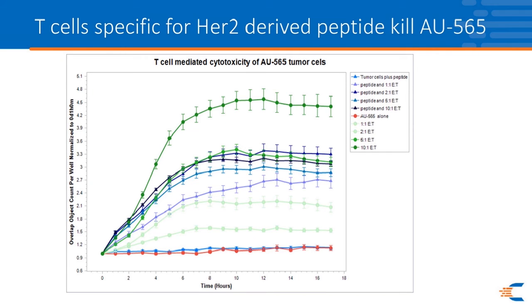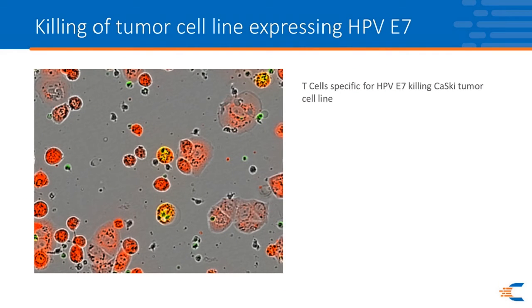So now when you put all of these images through, the nice thing is letting a computer figure out what's live and what's dead. Essentially, to go back to this picture, images from the experiment are used to set the parameters so that you're only measuring the events you want to measure. It's similar to flow cytometry in that you can adjust your parameters to look only at large cells, only at small cells, just the red, or just the green. And that is done initially. Usually, once you've worked the parameters out, you don't even need to think about them anymore, but apply that analysis to every plate you run after that point.